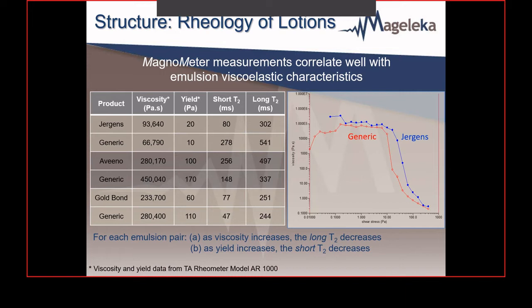Now, there are 2 limited types of rheological behavior possible: deformation, elasticity, and flow, viscosity. Emulsions, however, are interesting. By the way, as well as emulsions, this also applies to semi-solid formulations. With mixtures of two immiscible liquids, they have mechanical behavior that's intermediate. They're, in fact, what's called viscoelastic. But there's a strong relationship between the structure of emulsions and their flow and deformation characteristics.